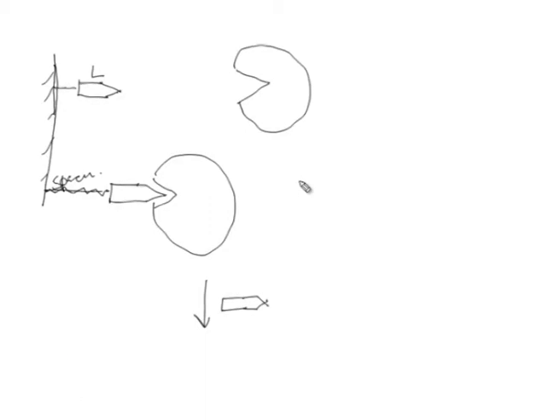Now, when you have a free ligand in higher concentration, what will happen? This free ligand in higher concentration will replace the bound ligand on the column. So, you will get an elution pattern where the free ligand has replaced the bound ligand, and this whole thing could then be passed in the elution, or as an eluate from the column.